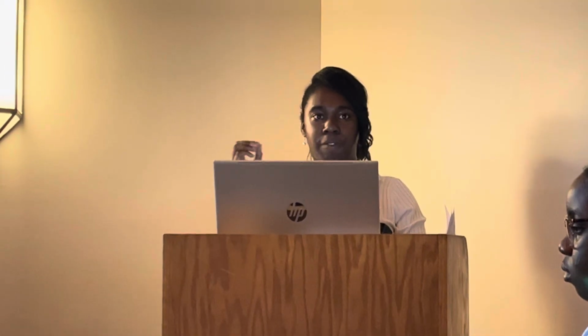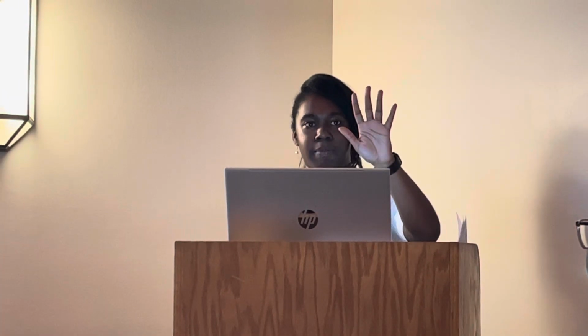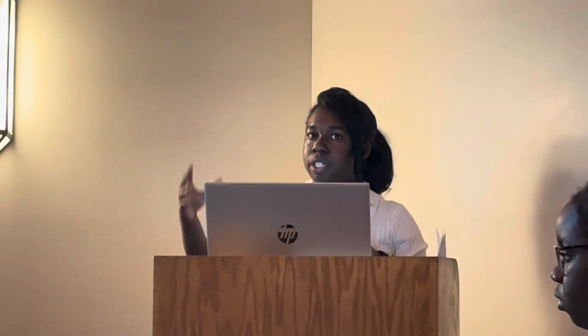And as you shoot it from all of the different angles, you can see, okay, where does the framework show up? So it's kind of like when you put your hand in one of those things at the playground and you see your hand on the imprint. If I were to put a rod there, you wouldn't see the same thing as my hand. So that's kind of what this graph is. As it shows up at certain peaks, that indicates a certain framework because the bonds and the rods are at a certain place. And so as you can see in the bottom two, if you get a wave, then it's amorphous, which means it hasn't crystallized. So as you can see, it didn't work.